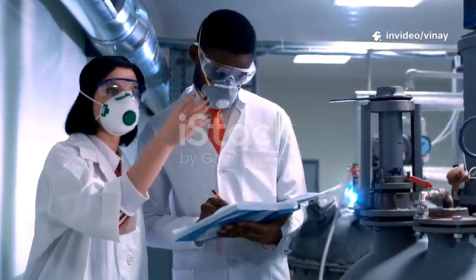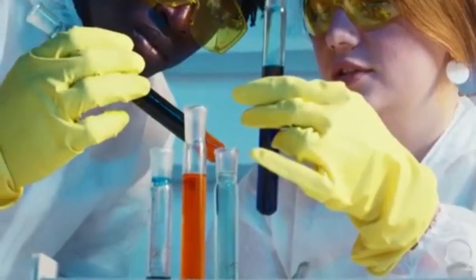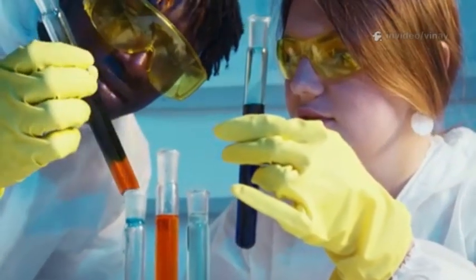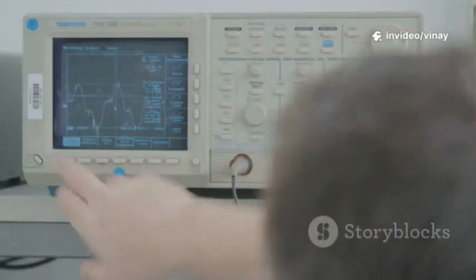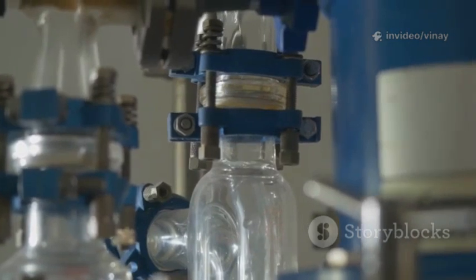You might hear people talk about the diffusion flow test and the forward flow test, and it can get a little confusing. The truth is, they are very closely related. You can think of them as scientific cousins. In fact, many people use the terms interchangeably. Both tests operate on the exact same principle.